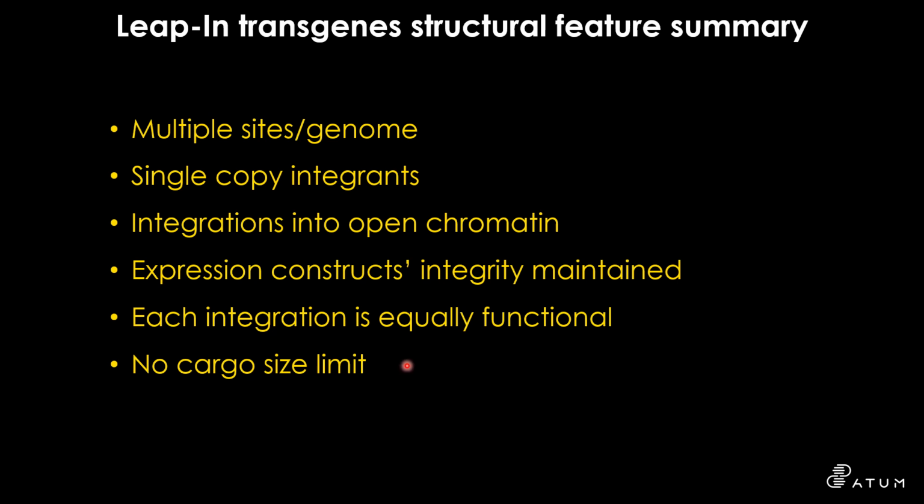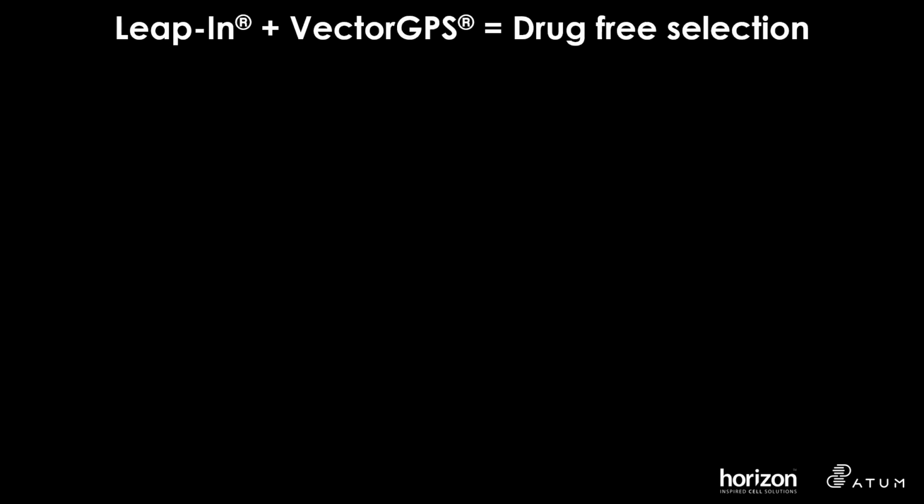And because there's no size limitation, we can build relatively large and complex vectors. How do we create these pools? These pools are created in a drug-free manner.